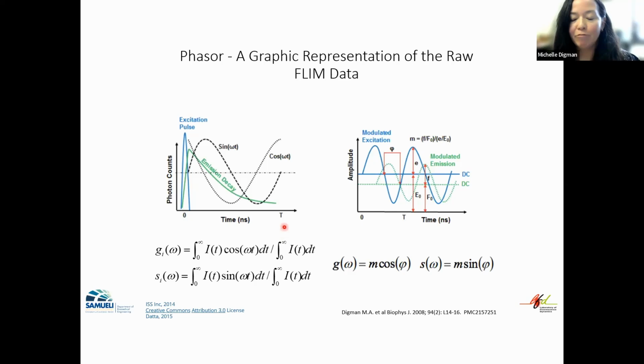So in fluorescence lifetime, you can actually use time domain, which I've already explained, using a very short pulse of light, femtoseconds, where the intensity of the emission signal versus time is recorded. When the signal decays to 1/e of the original starting value, that's about 36.8%. This is what we call the lifetime.